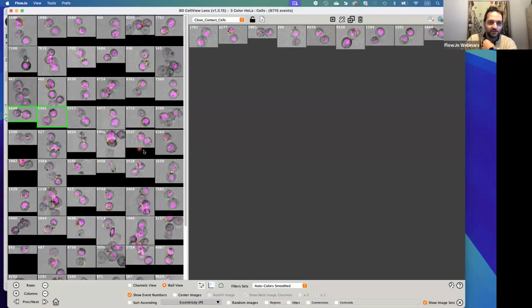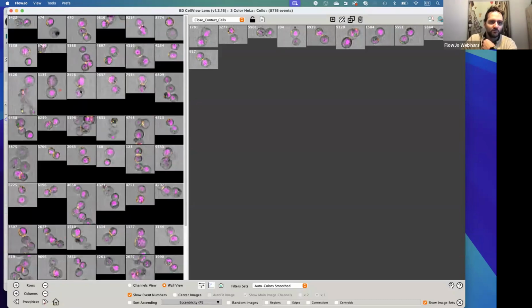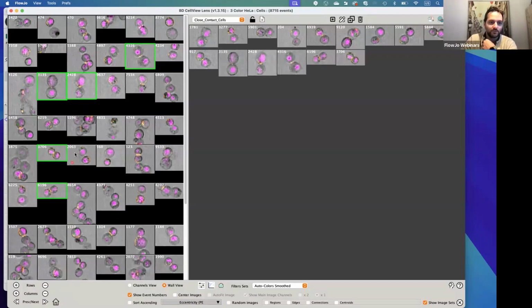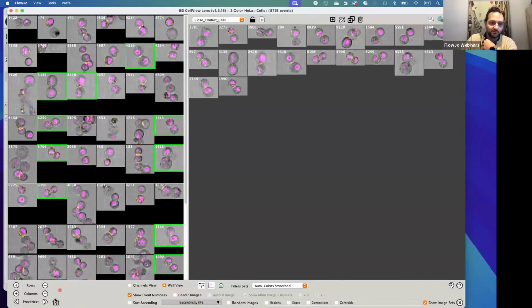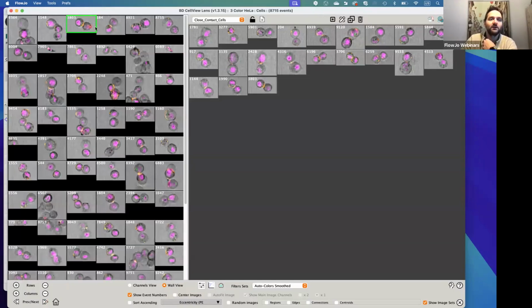Here I see some close contact here as well. I'll make just a few more. So here I see I'm in a hotspot of eccentricity where all of them pop up. This one, so here I see a lot. So it could be eccentricity that is very important for this exact population, but it remains to be found.